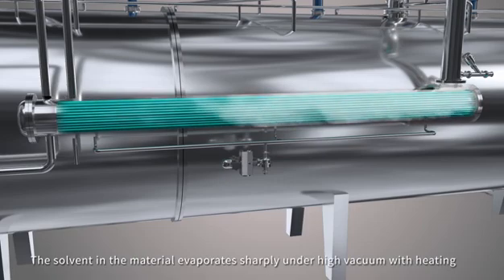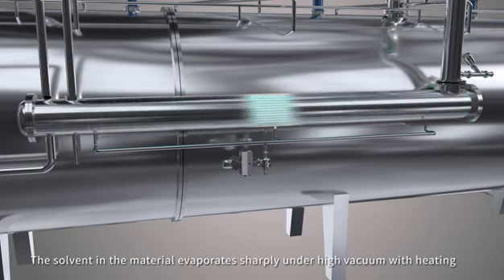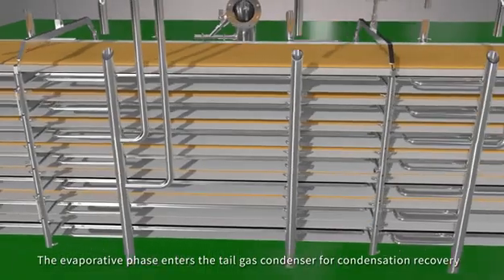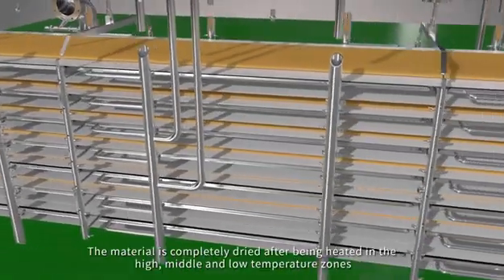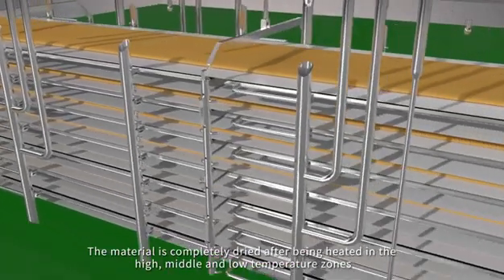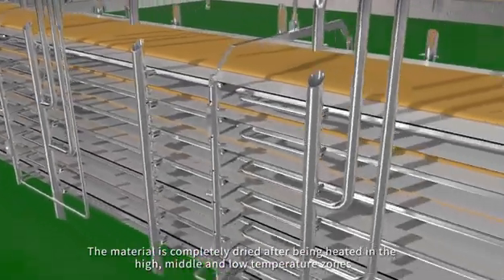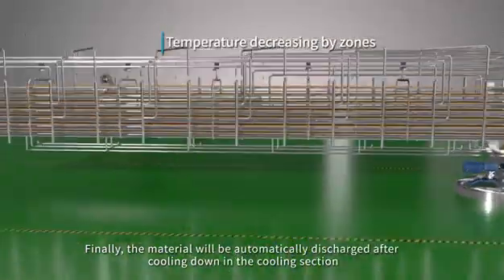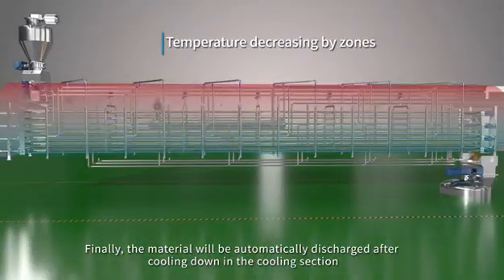The solvent in the material evaporates rapidly under high vacuum with heating. The evaporated phase enters the tail gas condenser for condensation recovery. The material is completely dried after being heated in the high, middle, and low temperature zones. Finally, the material will be automatically discharged after cooling down in the cooling section.